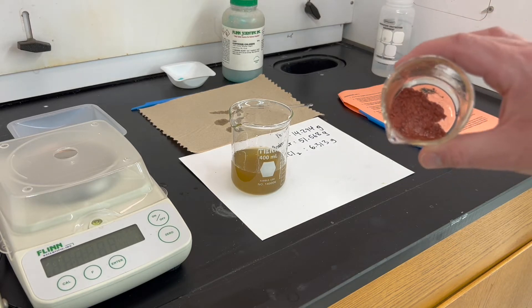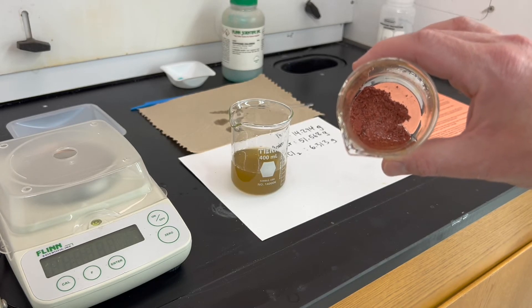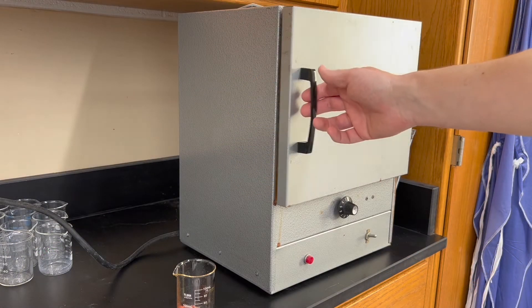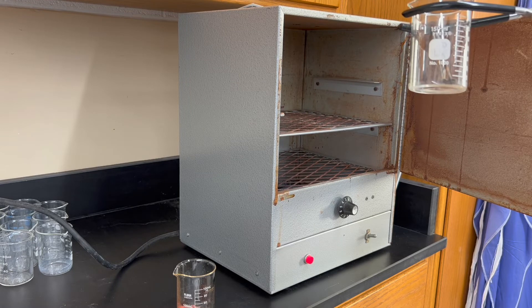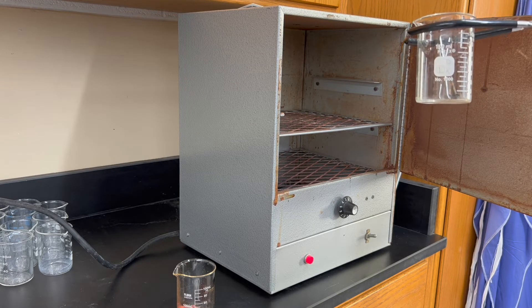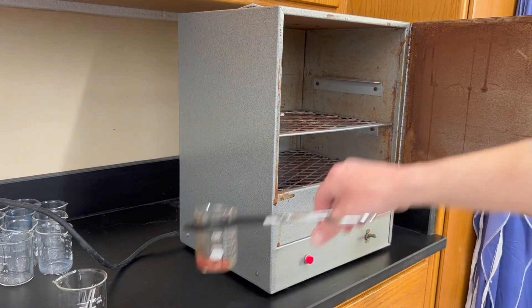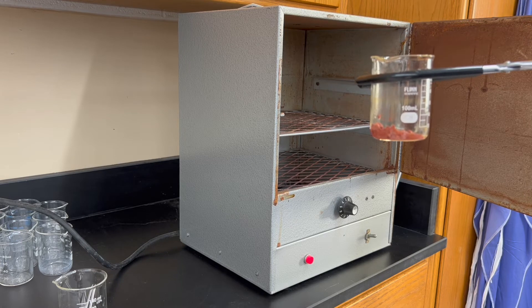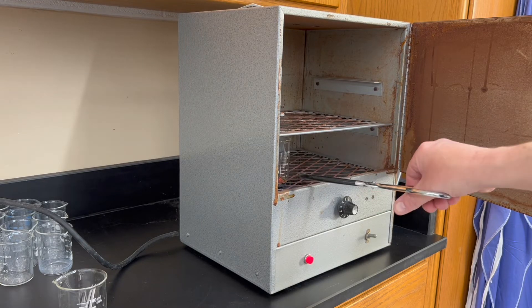Once you've gone through that process three times, your copper should look fairly clean and reddish brown. Then take it over to the drying oven. At this point the iron nails should be fairly dry — remove them using beaker tongs because they will be hot. Hopefully you've labeled your beaker so you know which one is yours, as there will be other people's beakers in the drying oven. Place the copper beaker in the oven as well, since we want to measure the copper's mass without any water adding to it.